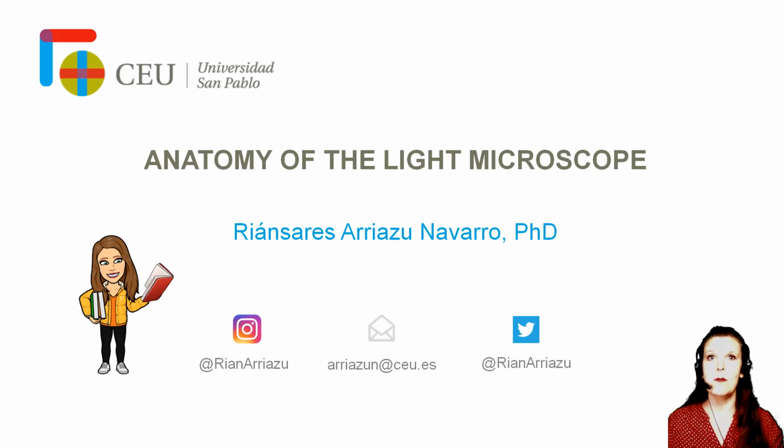Hello, here we are going to review the anatomy of the light microscope. This is a very important tool that we are going to use in our biology lab. Let's go!